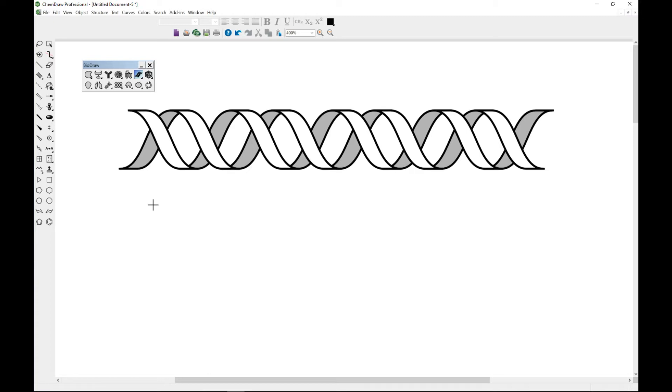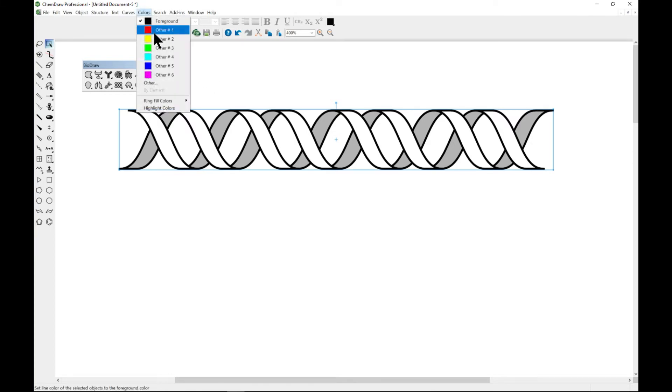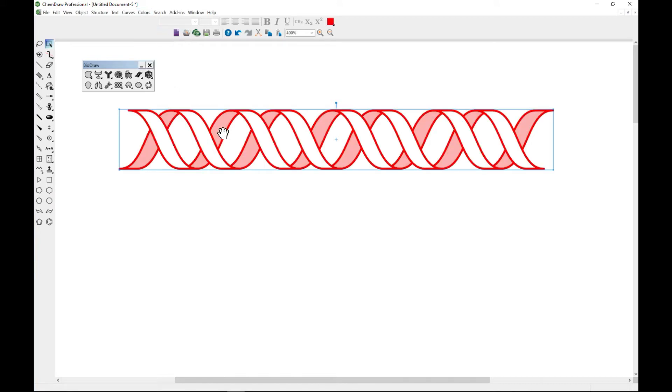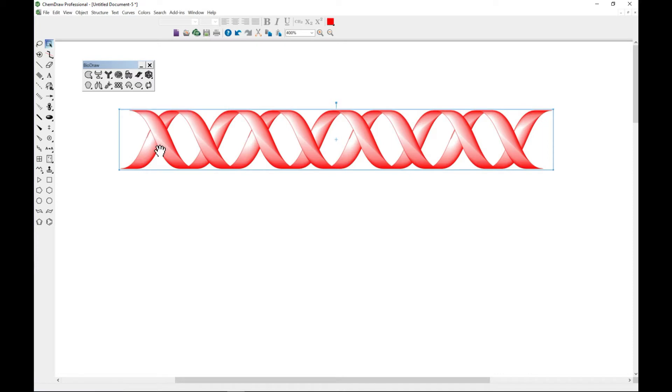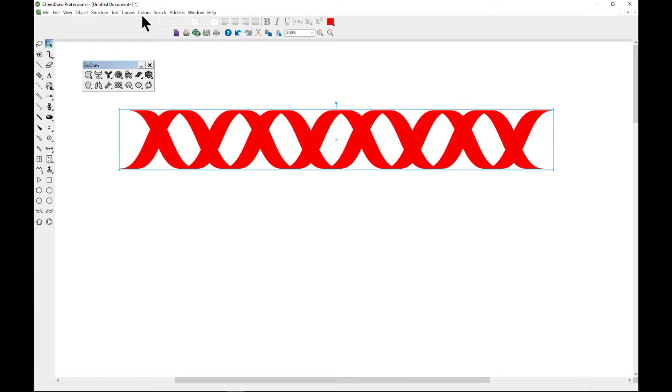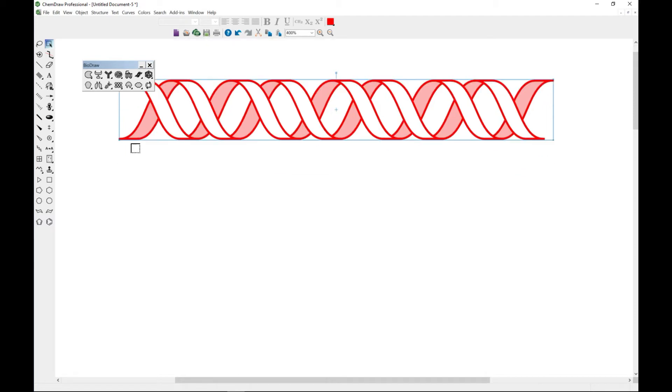You can always color your DNA as with other objects, so you can select this and from the color menu you can go to any color that you need. You can also go to curves and change, so this is faded. You can change to shadow and it changes curves, you can change to field and it changes. That is something to also note.